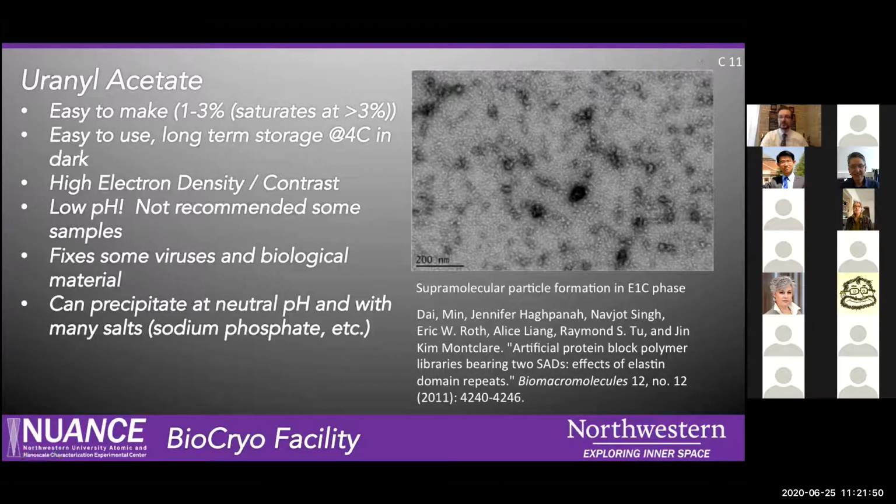And even though it has a low pH and therefore may denature biological materials, the rate at which this happens is often not considered a deterrent, but it's something that you want to take into consideration. This may be an important point for your sample. But it's a very nice, straightforward stain to use. The high electron density does lend to really nice contrast in the TEM.